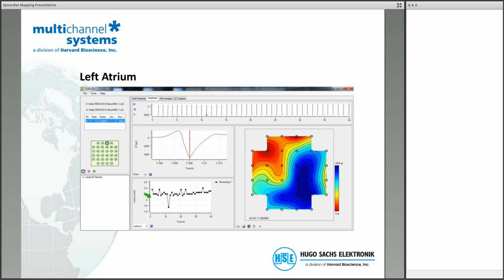And let me point out one thing. You see we have here a delay of just about 2 milliseconds for the signal propagation over the entire array. And even though cardiac signals are by far not as rapid as neurons, when you want to do a reliable mapping, it is sometimes a very helpful feature to be able to scale up the sampling rate to something like 20 or 30 kilohertz to really be sure that you detect the right points in the depolarization.